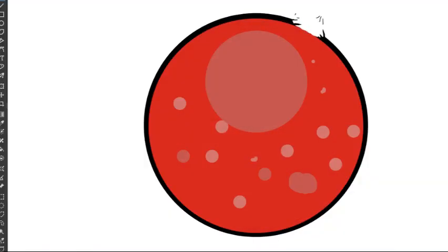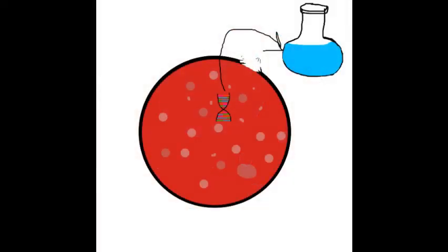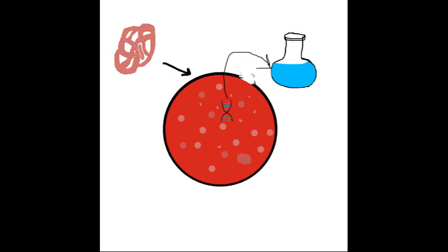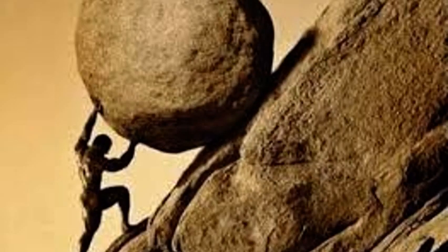Extraction is the process of opening the cell's nucleus and isolating the DNA molecules in another solution. It is best to try and find as much DNA at the crime scene as possible, but contamination by other substances, such as hemoglobin, can provide a degree of difficulty in the later steps.